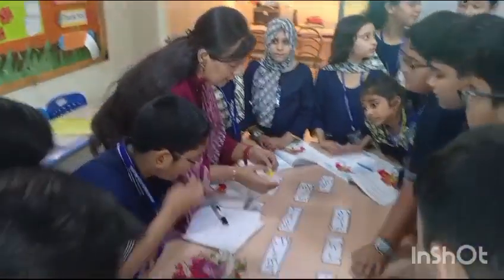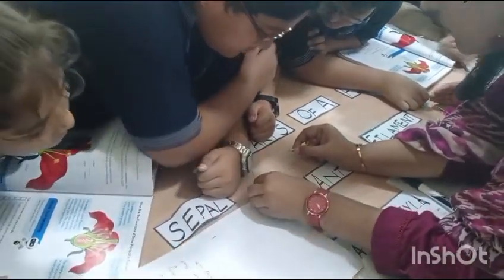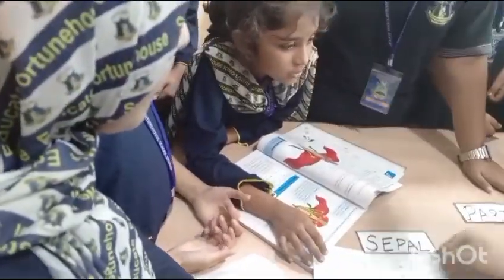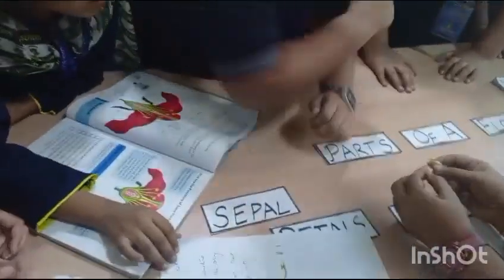Very carefully, put the sepal on the page. Okay, let's put the sepal on the page. Now girls, put the sepal. Now these are the sepals. Now after that you can see this part.